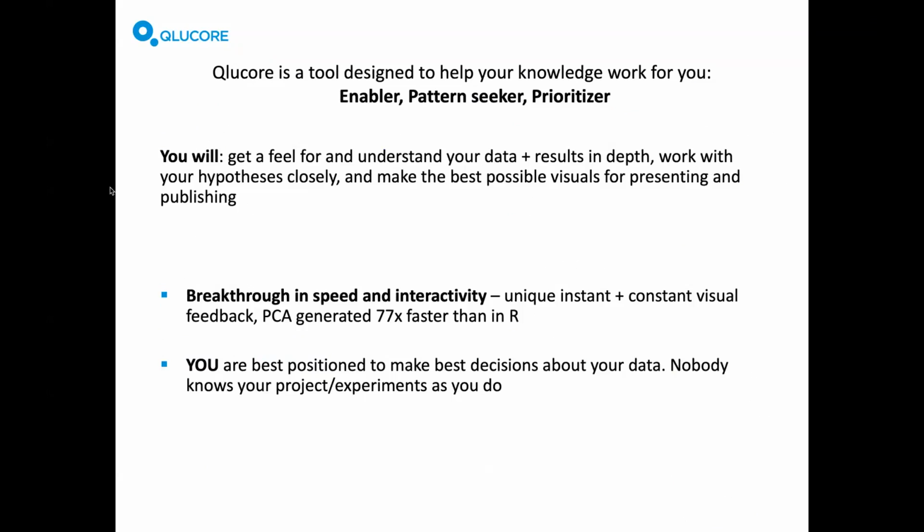So the main strengths which Qlucore will bring you, apart from the algorithms and outstanding speed, is that it will help you. It will be enabler and pattern seeker and prioritizer. It will aid your brain and your mental manipulation with hypothesis and discovery.